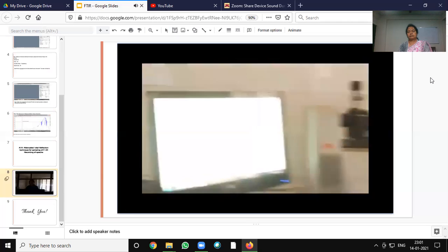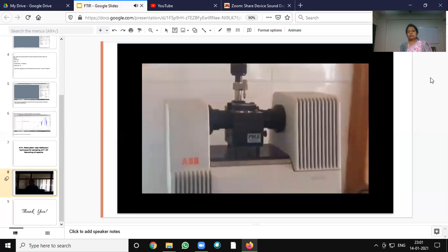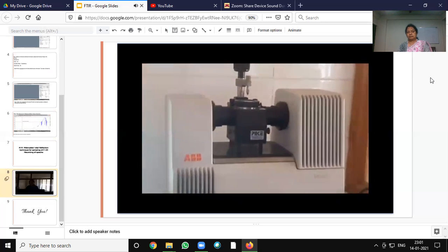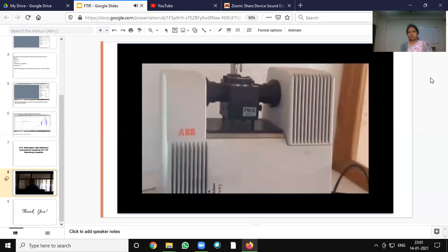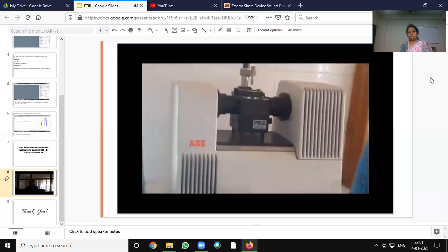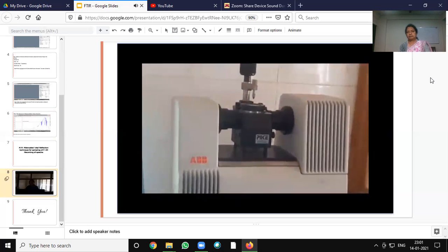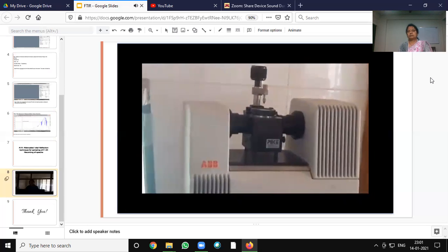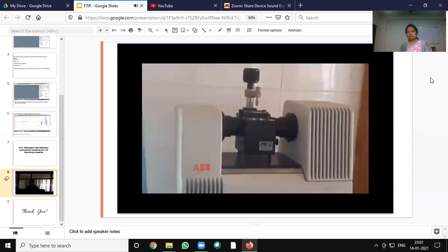Now FTIR with attenuated total reflection is used for raw material verification, quality control and scientific research. In this technique there is no need for sample preparation; all types of samples, in any size and quality, we can measure.